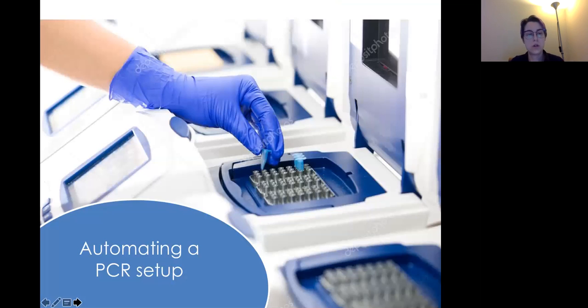And today I'm going to talk about automating a PCR setup. I'm a bit conscious of time, so I may skip some slides, but I'm going to give you all these presentations. I'm not sure if you have the PCR module inside the OpenTrons, but still you can automate the PCR reaction and then put your reaction into a PCR machine outside of the robot.